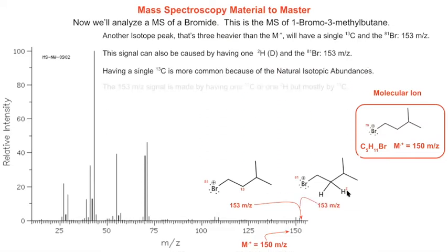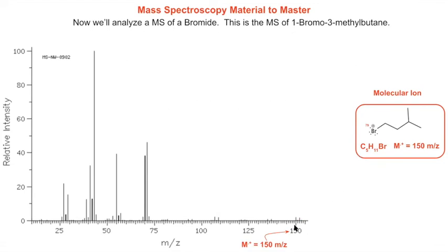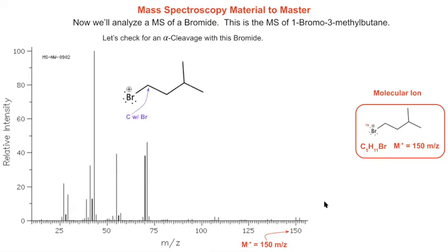It's nice, right? Able to label all these nuances. So we're able to label all 4 here. And let's label some more too. So this is a carbon with a bromine. This is the alpha carbon.